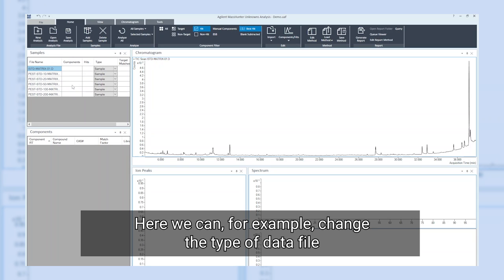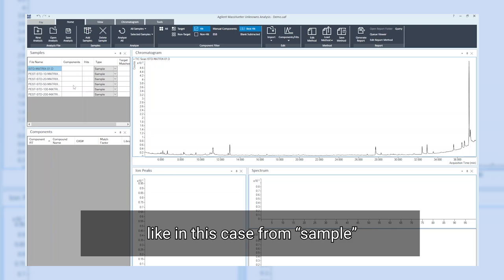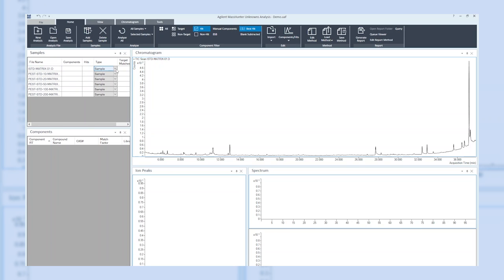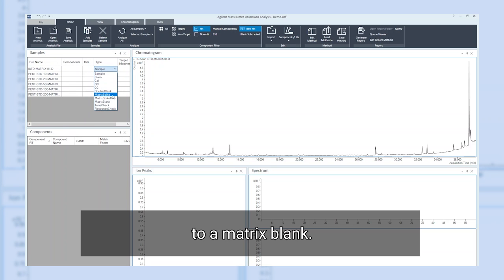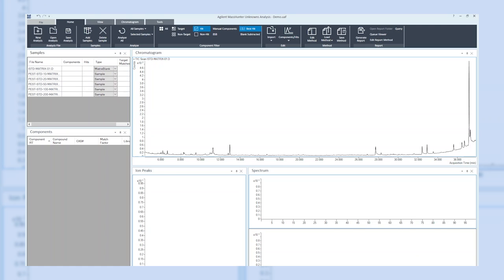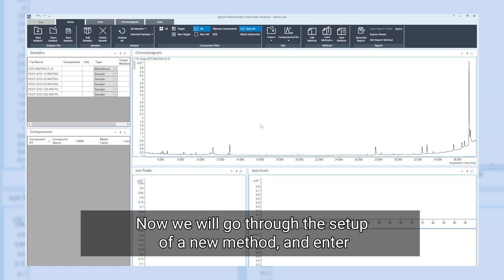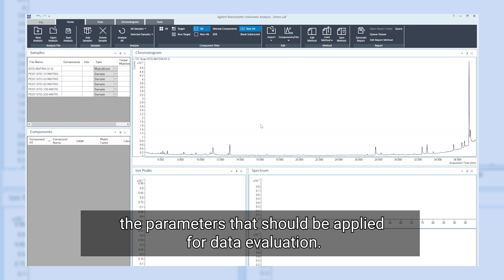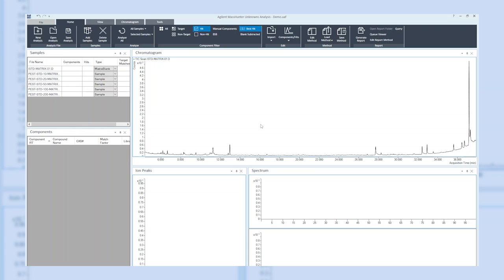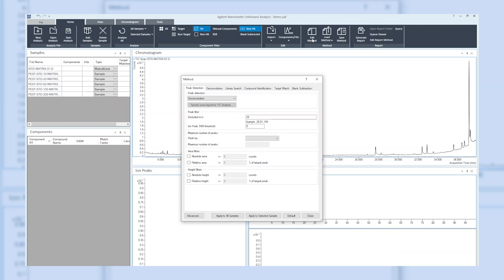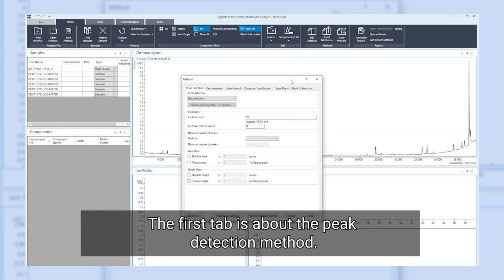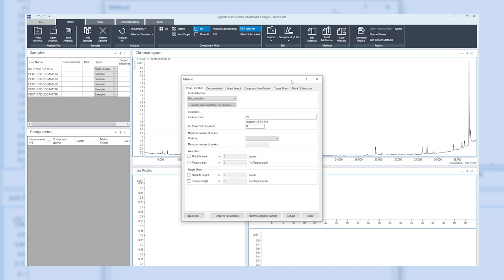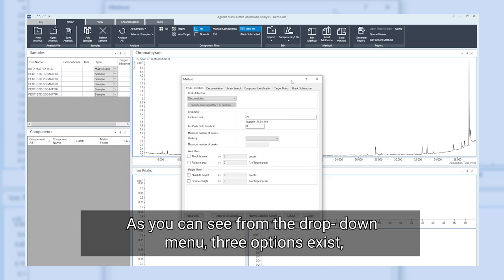The selected data files will now appear in our sample table. Here we can, for example, change the type of data file, like in this case from sample to matrix blank. Now we will go through the setup of a new method and enter the parameters that should be applied for data evaluation.